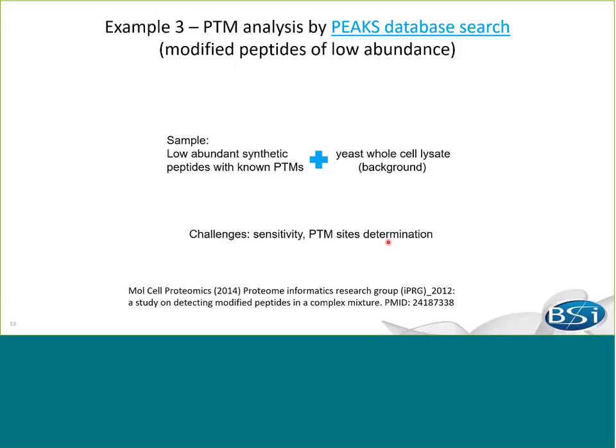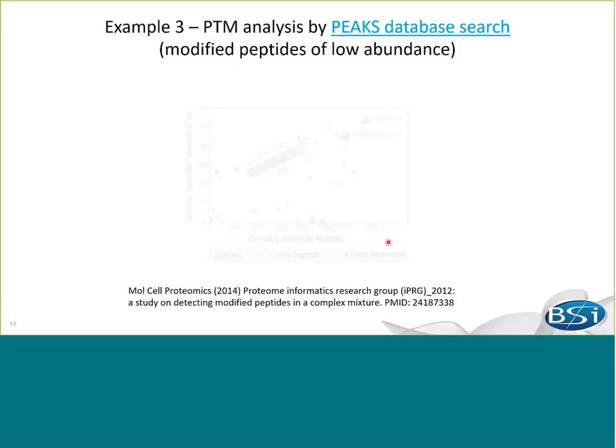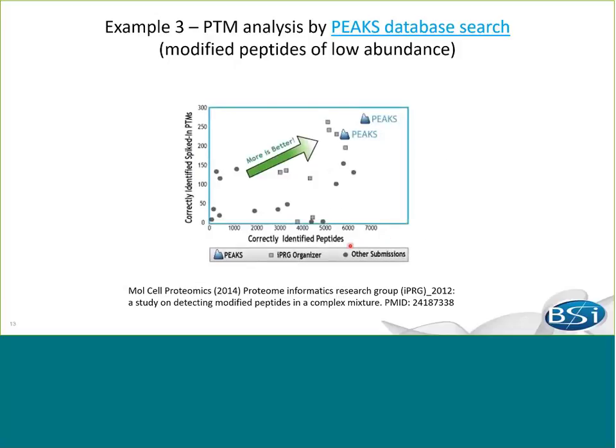PEAKS demonstrated superior performance in terms of both the total number of correctly identified peptides and the number of correctly identified modified peptides that were spiked in. Now, of course, we can do better than this old version of PEAKS.